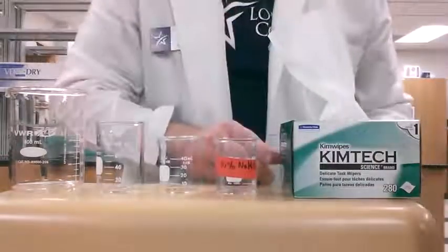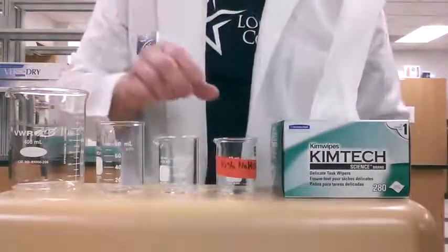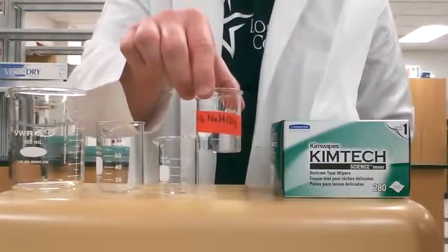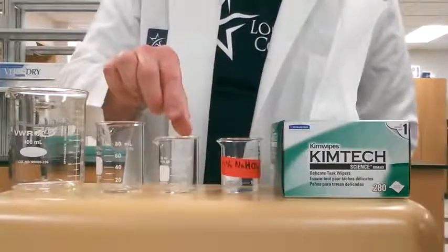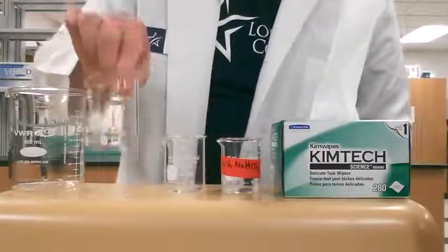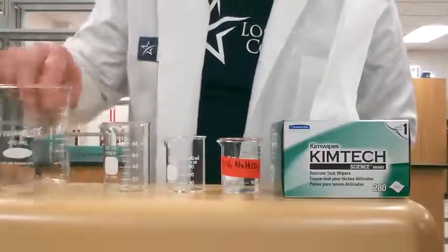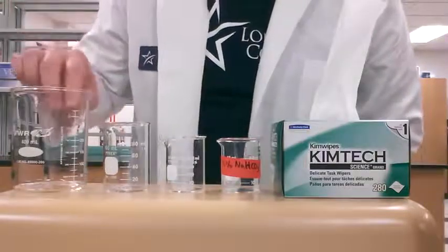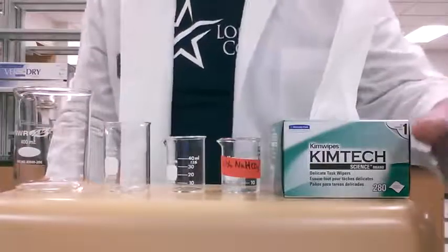The first thing you're going to need is some chem wipes — that's these things right here. The solution that you're going to measure — in my case I have a 10% sodium bicarbonate solution. Then you can use either a small 50 ml beaker or a 100 ml beaker. I also have a larger beaker; you don't have to use this, but I'm going to use it for a rinsing step because I don't have a sink right here.